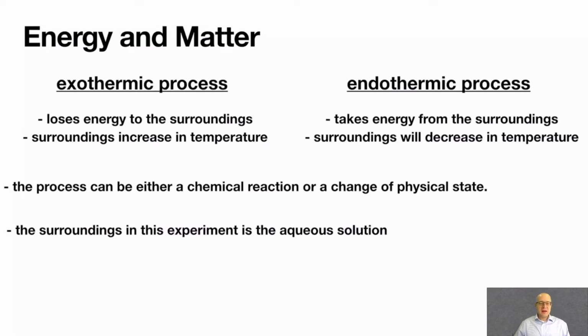That's the fun part. In an exothermic process, the energy is going out of the reaction and into the surroundings. In today's experiment, the surroundings happen to be an aqueous solution. So the solution the reaction is occurring in is getting hot. Now the reactants are giving off that energy. Okay? The two things are colliding and they make a bond or they do something cool and energy is given off and the surroundings get hot. You can feel it with your hands if the reaction's hot enough. Sometimes it's so hot it'll boil water, believe it or not.